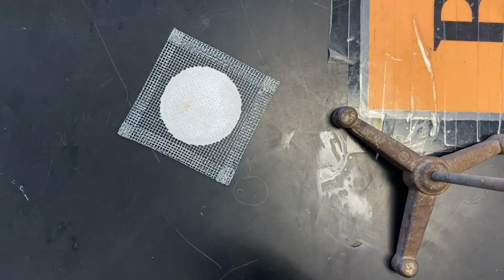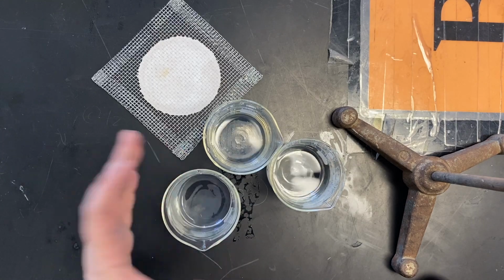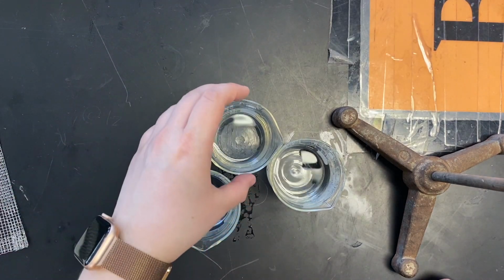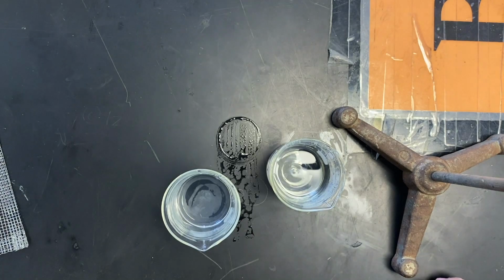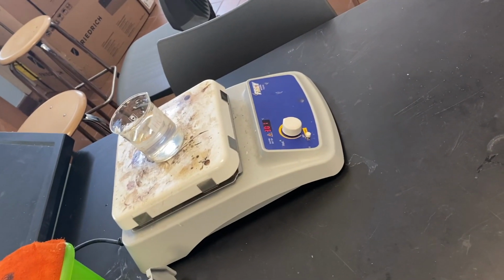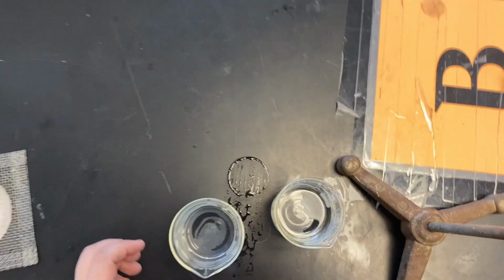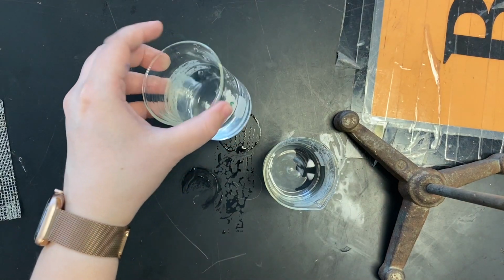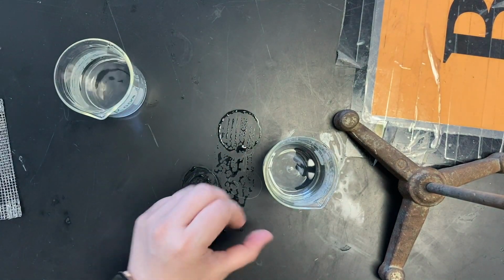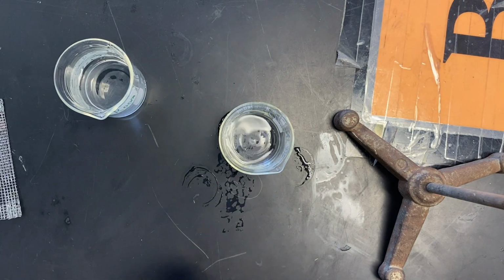Okay, so now that we have about halfway full of water in all of our beakers, we are good to go. So we're gonna take the one that says hot, throw that on the hot plate. We'll let that heat up for about 5 to 10 minutes, so let's just leave that and focus on the other two. So we have one that says room temperature, we're just gonna leave that be, and one that says cold. So for the one that says cold, we're going to add ice to that.